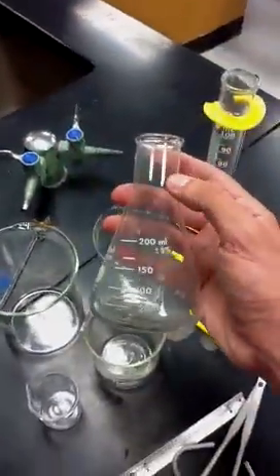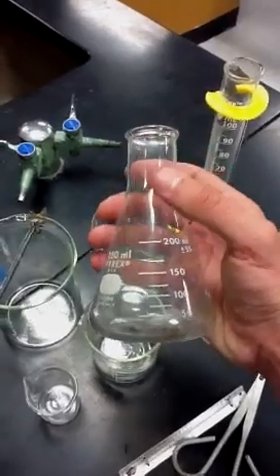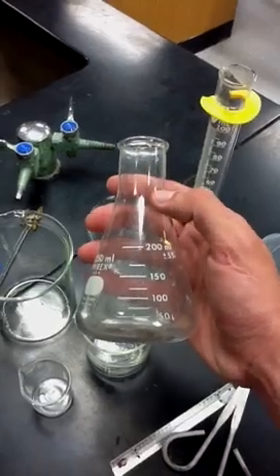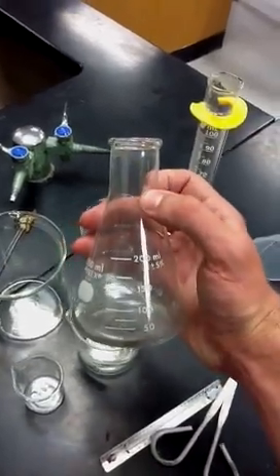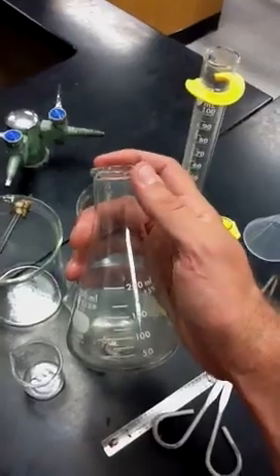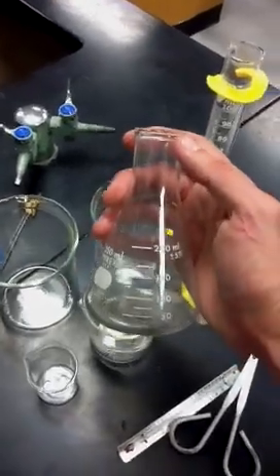We also have this contraption here. This is called an Erlenmeyer flask. You may be wondering why the top is narrow, unlike the beaker. Well, if you've got something boiling in here, it's splashing out a lot of liquid. You don't want to get it on your hands, so they made it narrow so not a lot of things can splash out when it's hot and boiling.